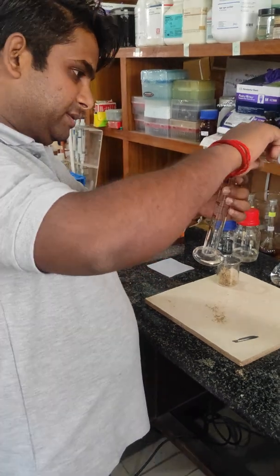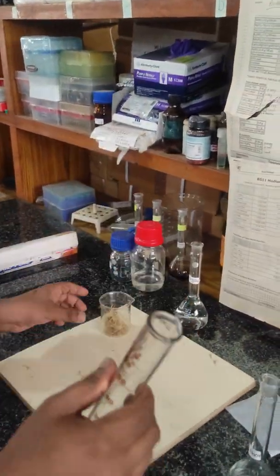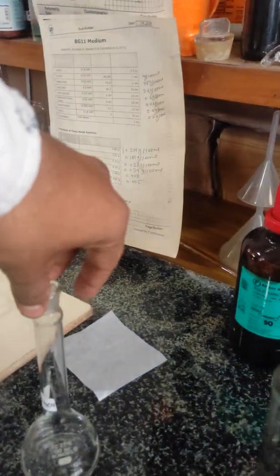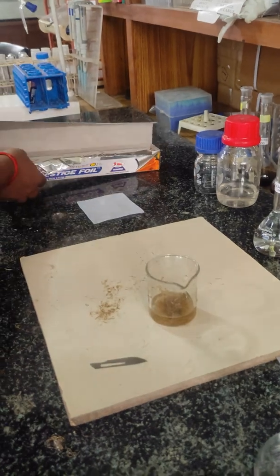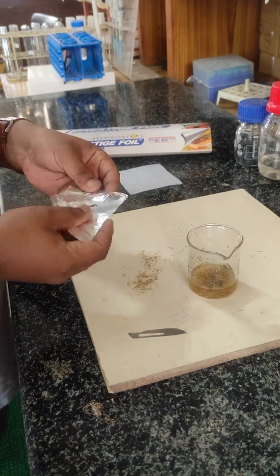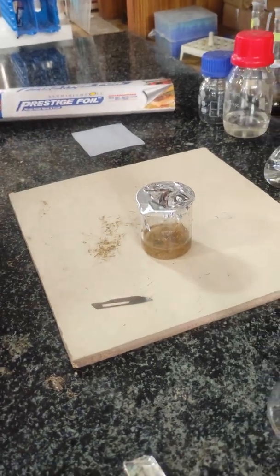I am going to measure 20 ml with the help of a measuring cylinder. I measure 20 ml of 5% NaOH and just pour the NaOH into the beaker. Mix the thallus with NaOH. You can cover the beaker with the help of muslin cloth or aluminum foil. Now we are going to incubate this at boiling temperature in a water bath.